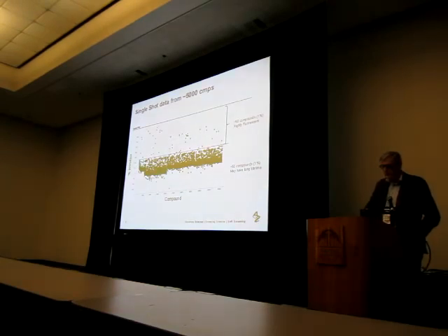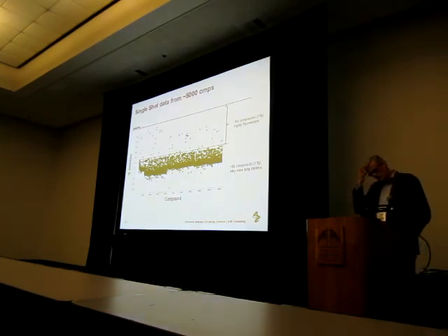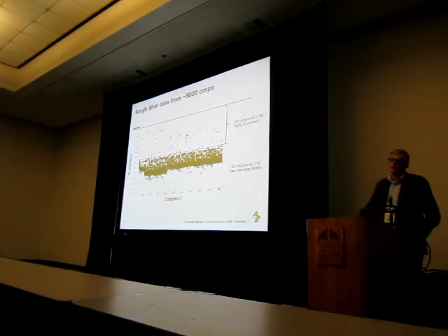And really what we were looking for here was to see how many compounds fell outside of greater than 125% inhibition and less than minus 25% inhibition. The outliers, how many were there really likely to be? And rather strangely and kind of fortunately, there were about 50 in each category. And even I can do the maths on that, so 50 out of 5,000 is fairly straightforward to work out what the rates were.